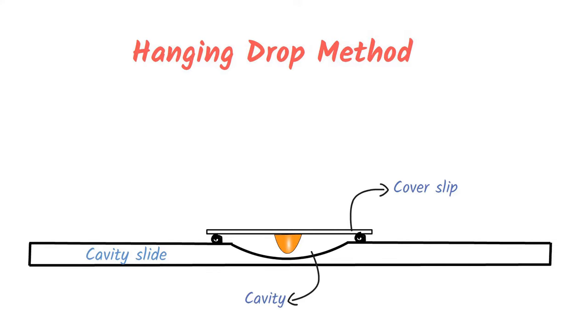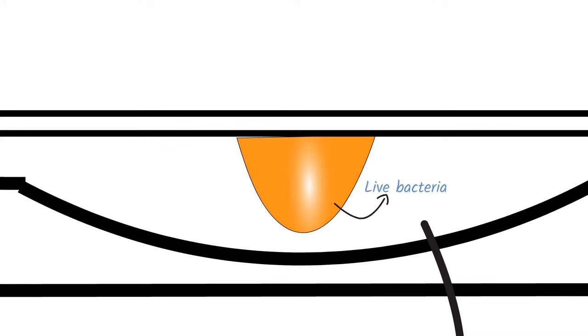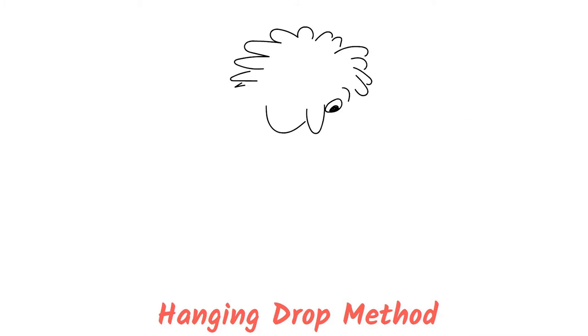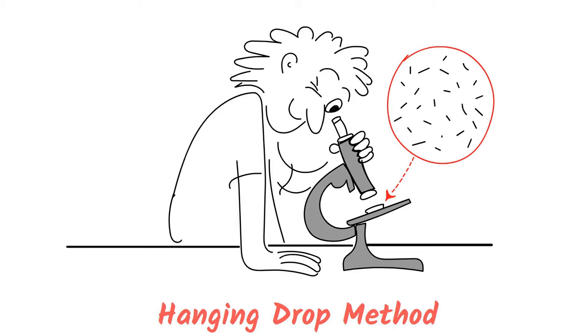The hanging drop method is a traditional technique where a very small drop of bacterial culture is hung from the center of a cover slip into the cavity of a cavity slide. This hanging drop contains live bacteria, and if these bacteria are motile, you can see them moving freely in the drop under the microscope. This would be an interesting activity for new students, to see moving bacteria under the microscope.